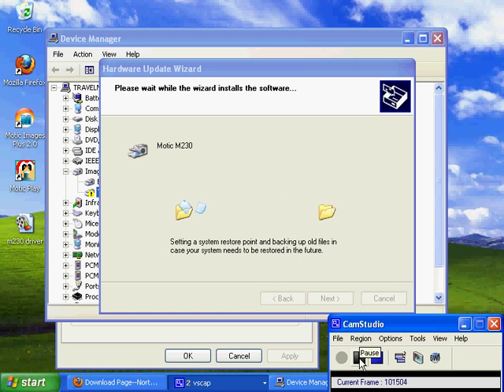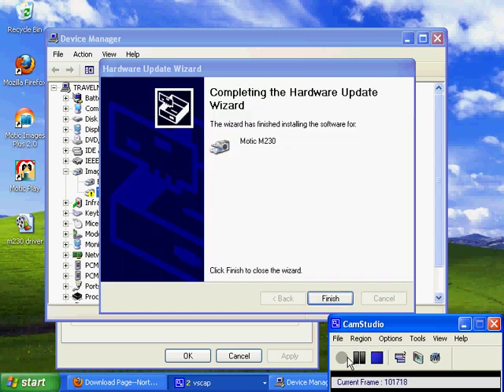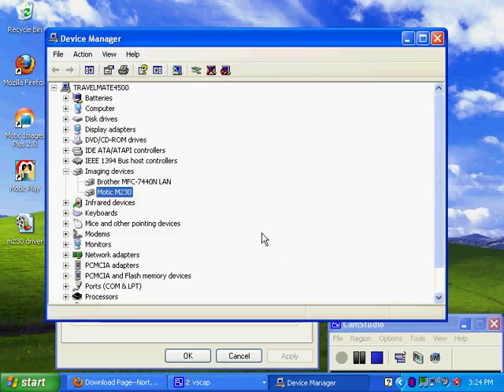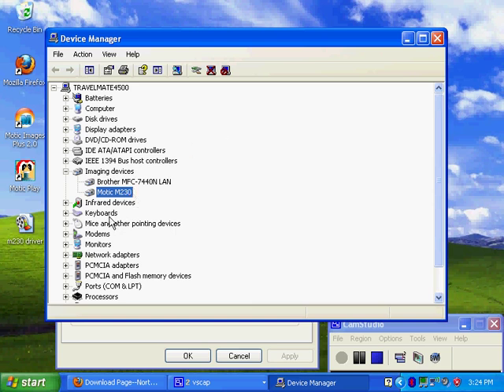Once it's done installing the driver, it will pull up this screen. It may ask you to restart the computer. Sometimes it will not. It depends on the computer. Either case, if it asks you to restart, restart the computer. If it doesn't, don't worry about it. Just click finish. As you can see now, my microscope is identified as Motic M230, and there's no yellow caution sign or anything beside it. That's a clear sign that the driver was installed correctly.